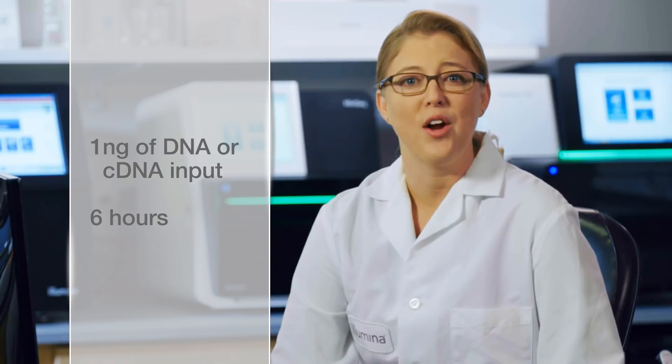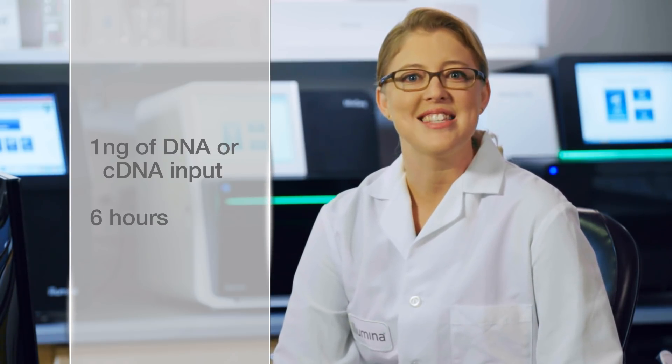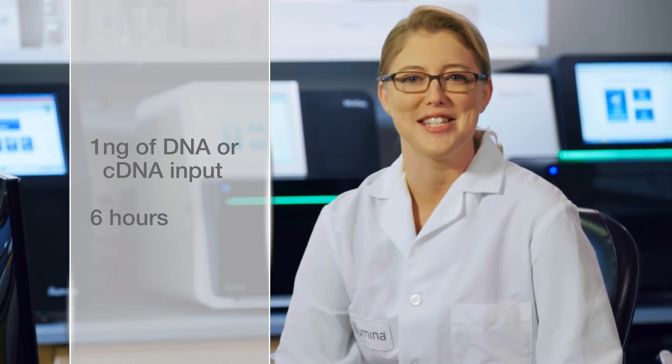Once the panel has been ordered, it's time for the fun part. What I'm most excited about is the simplicity of the AmpliSeq process. Once your DNA or cDNA has been quantified and is ready to go, starting with as low as one nanogram of input, in less than six hours you can have ready-to-sequence libraries. Let's take a closer look.